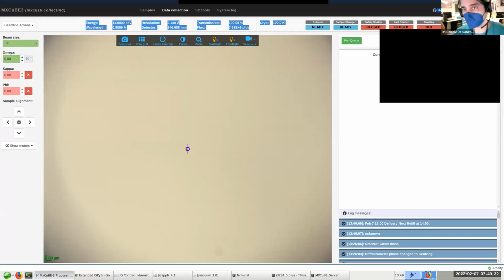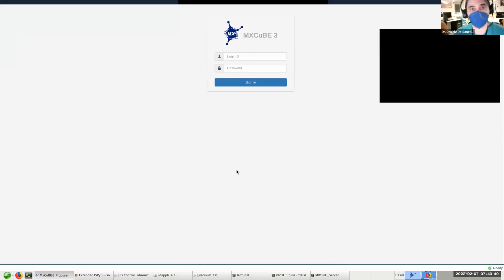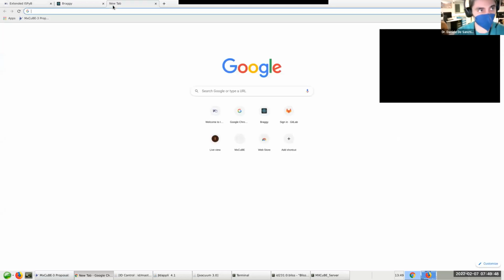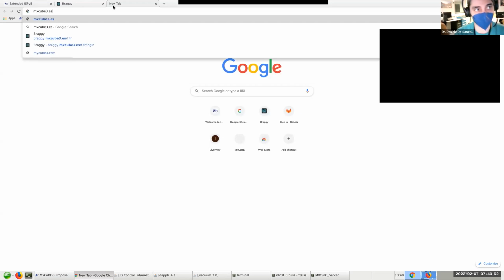Okay, so let's sign out. So we start from scratch. So you know that when you start your experiment, you log in through Google Chrome or any other browser to this page, which is mxcube3.esrf.fr.